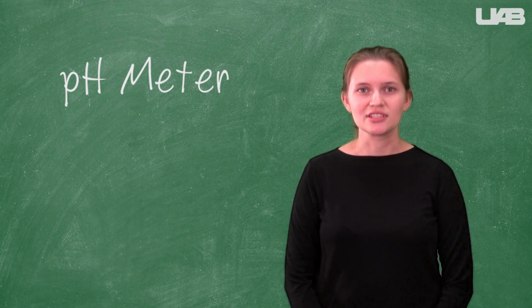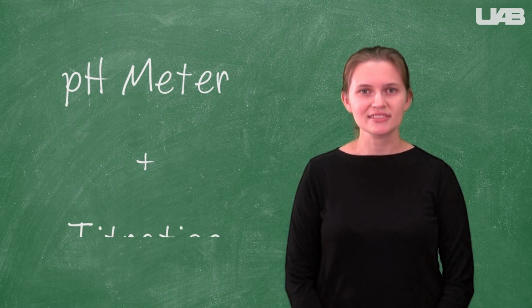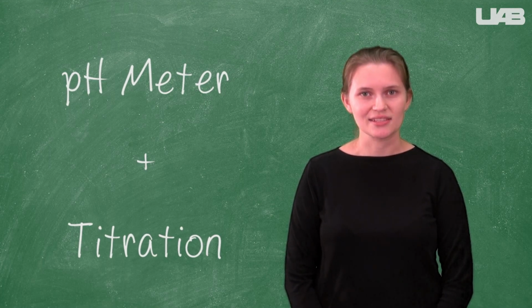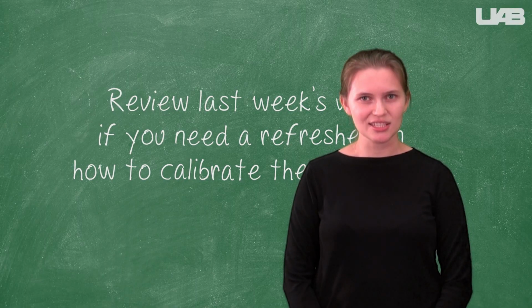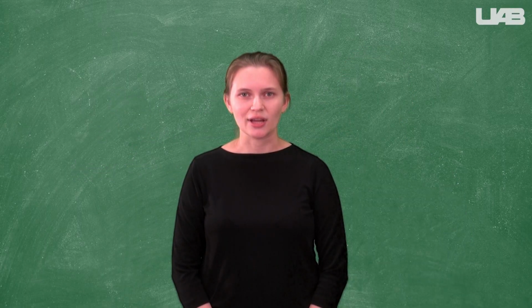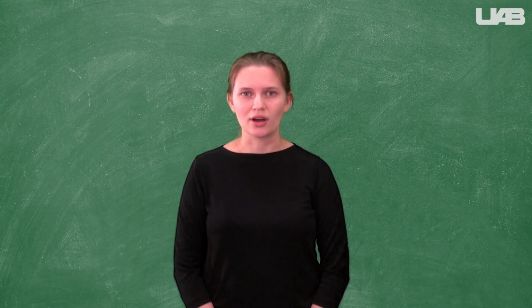Today, you will use your new skill, taking pH measurements with a pH meter, with a skill that you practiced a lot last semester, titration. Calibrate your pH meter just like you did last week. Once it is ready, you can begin exercise 1.